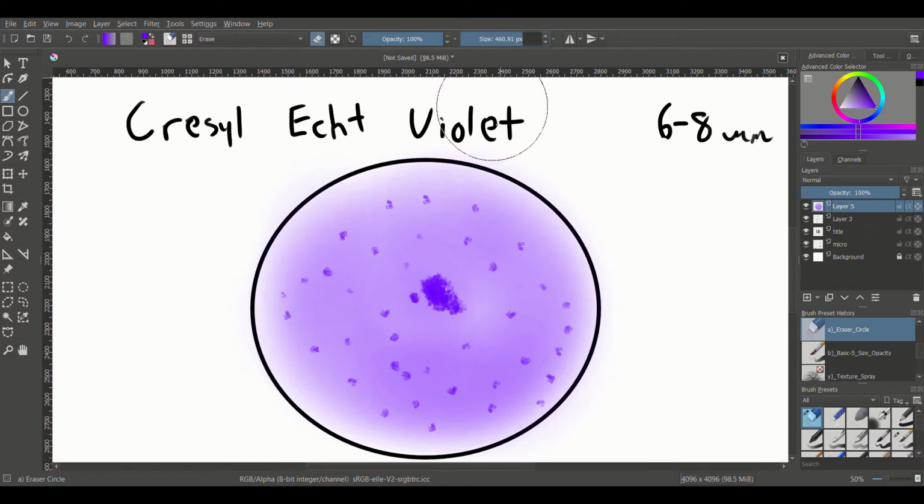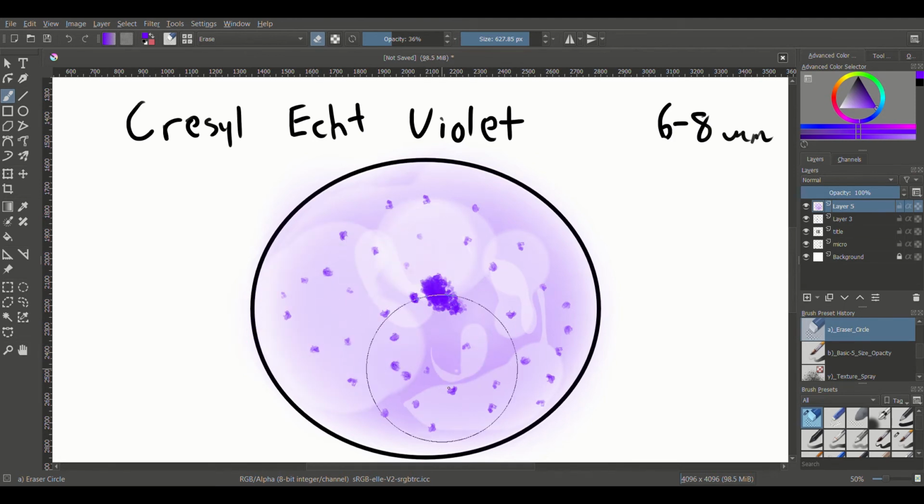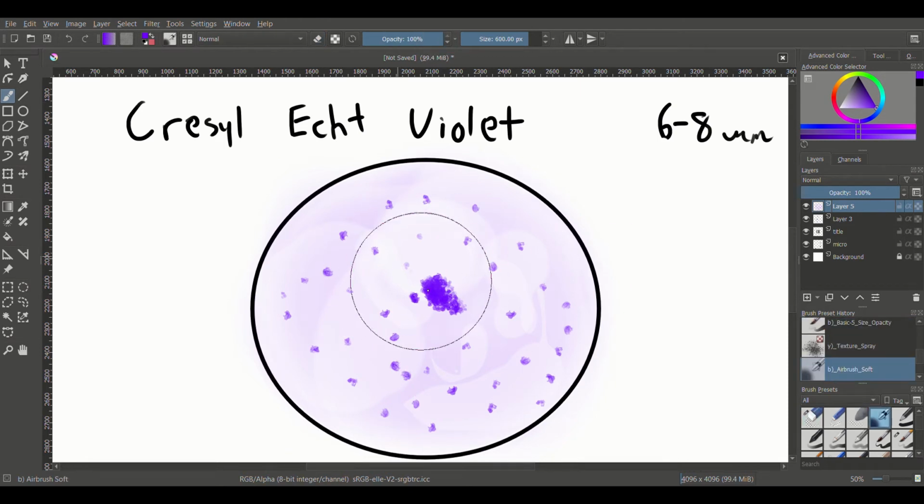So as you differentiate it, you're going to see the background just kind of fade out until eventually, in this method, you're still going to have some. It's not going to be completely clear, but it's going to be pretty good. You're going to be able to see the Nissl substance and the nuclei. And the chances are when you do this differentiation, it's kind of hard to control. Also, you can't really see it macroscopically, so you have to check it microscopically after you're done with it. So it's hard to look at the slide and say, oh, okay, we're done differentiating.